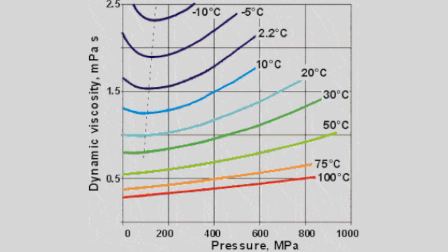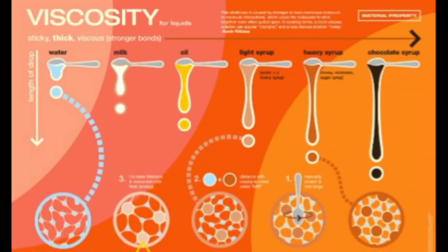Viscosity is a function of temperature and pressure. Although the viscosities of both liquids and gases change with temperature and pressure, they affect viscosity in a different manner. It increases with stronger intermolecular forces caused by the increase in the molecular weight and decreases with higher temperature.